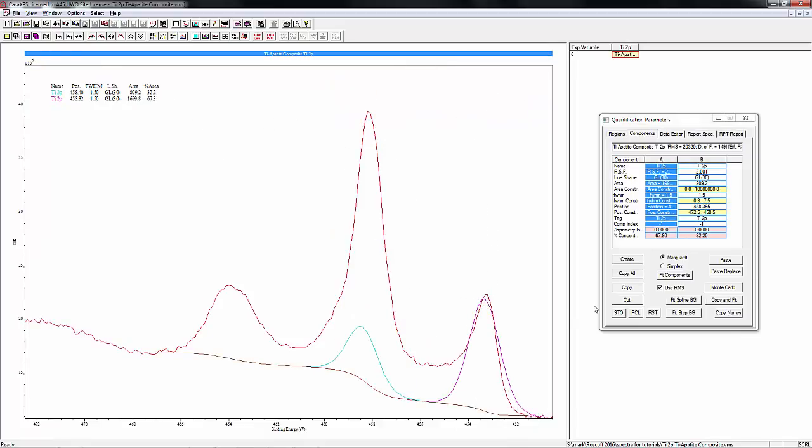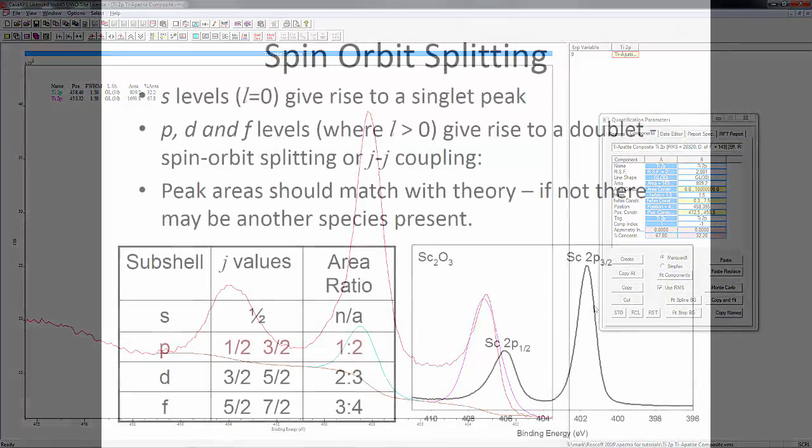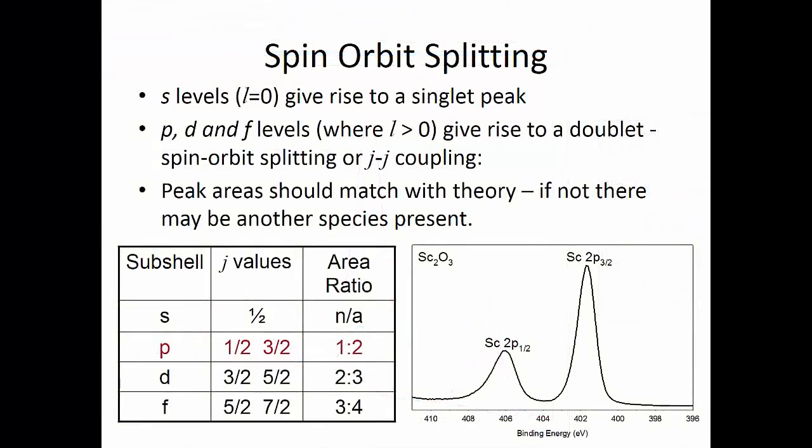We're going to talk a little bit about what we need to do to constrain these two peaks. For spectra with spin orbit splitting, there will be a specific area ratio between the peaks and we'll need to constrain our spectrum to mimic that. For the 2p peaks, we have between the 2p3/2 and the 2p1/2 peaks an area ratio of 2 to 1. If we were looking at d orbitals it would be a 3 to 2 ratio, and f orbitals it would be a 4 to 3 ratio.